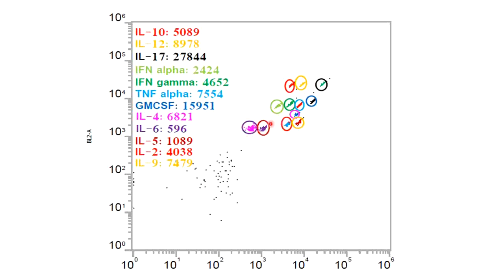Each circle denotes one type of cytokine, and you can measure their fluorescence intensity, and within a day you can do 100 samples. That is the speed of the instrument, and in each sample you are measuring 12 to 13 cytokines, so you are finishing your research paper in a day. Amazing technique. High throughput analysis. You can measure cytokines, chemokines, growth factors. Whatever is secreted in terms of protein by the cells can be analyzed by CBA, the flow cytometry based bead array system.